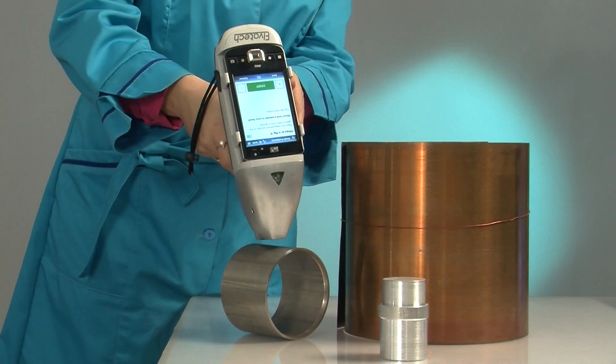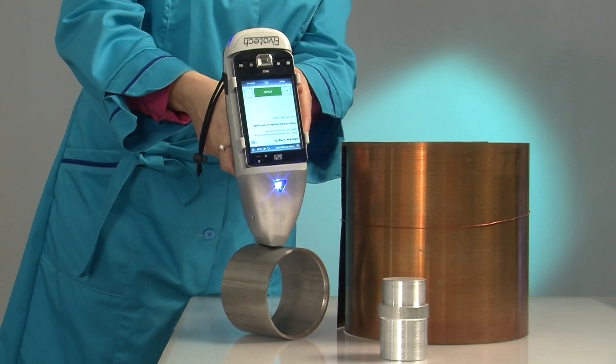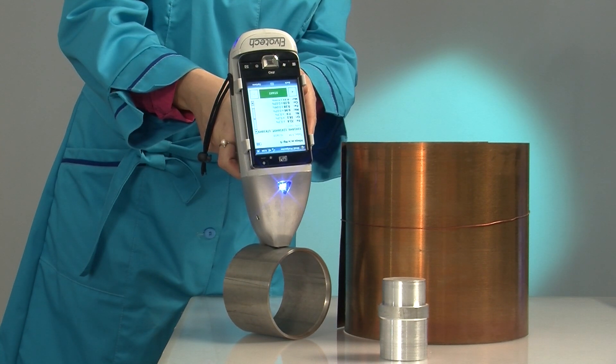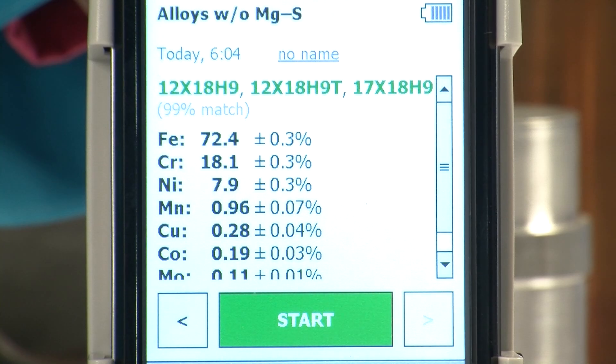The alloy library will let you determine the grade closest to the sample as well as the match percentage. Elvax Prospector is equipped with a sample proximity sensor, preventing the instrument from accidental X-ray emission. For the operator's convenience, measurement status is reported by voice.